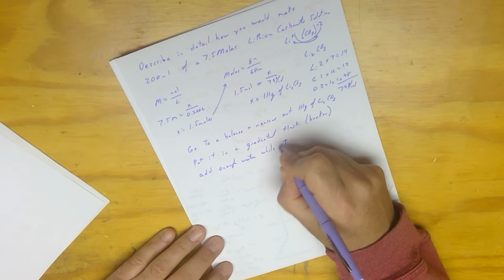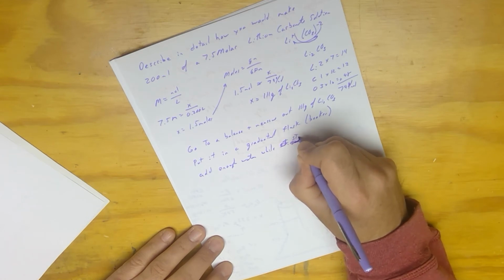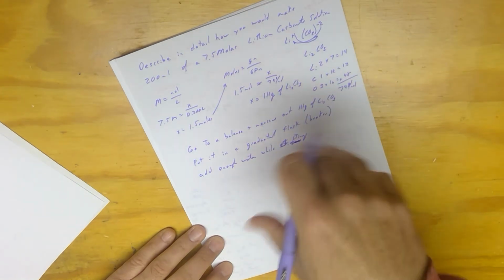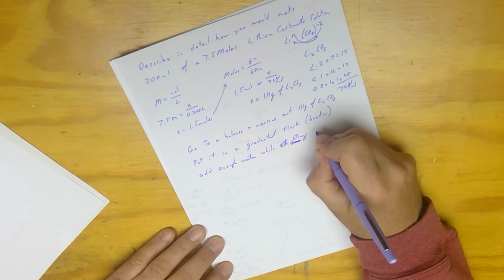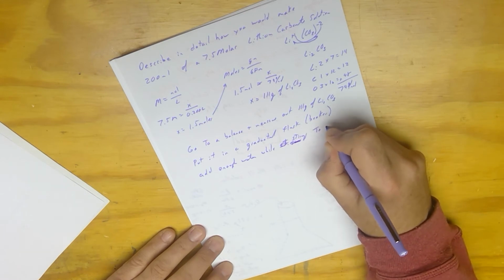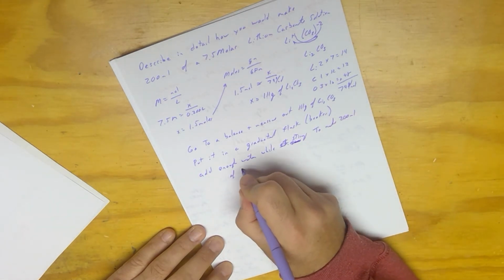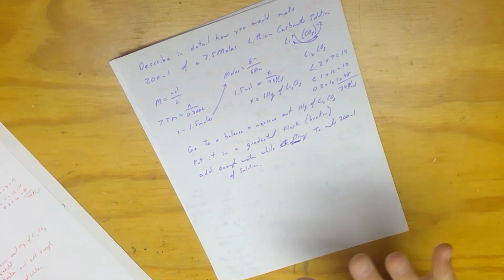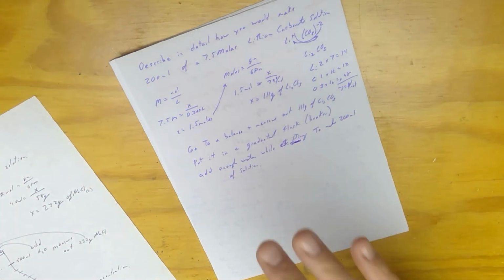Stirring, swirling. Maybe swirling is better. I guess stirring is better. You know what I mean. Add enough water while stirring to make 200 milliliters of solution. Good. Yeah, that's not too hard. So this is making a solution.